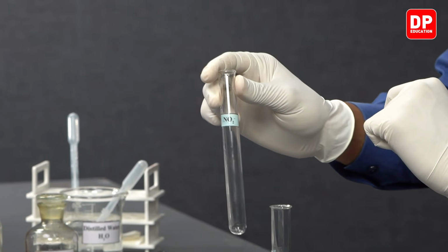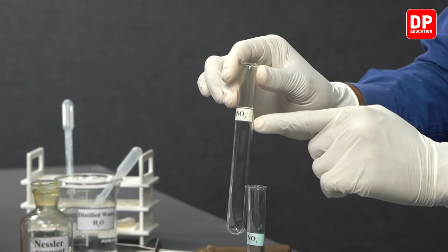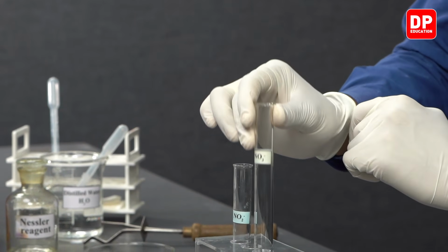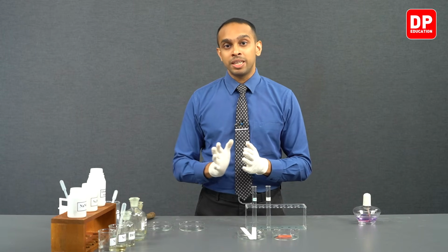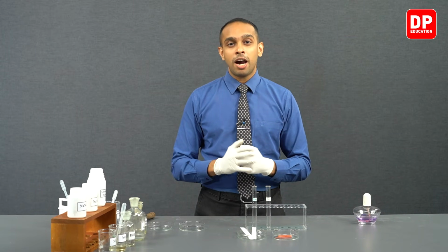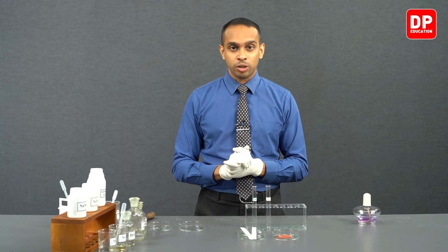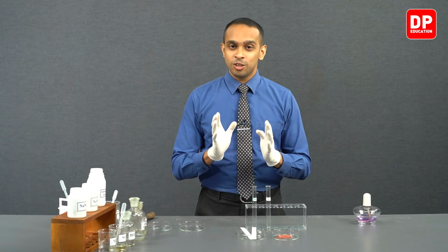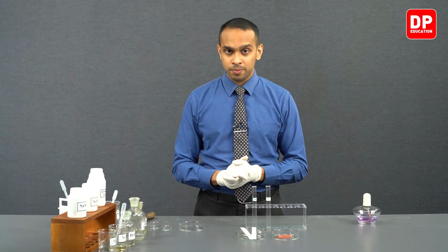So over here, to this test tube, we will take a small sample of nitrite ion solution, and to this test tube, we will take a small sample of nitrate ion solution. And then to it, we will add a little bit of aluminium powder. Afterwards, we will gently add a small quantity of concentrated sodium hydroxide to each of these test tubes.